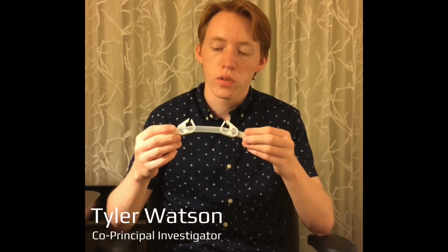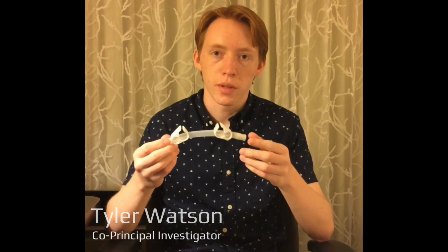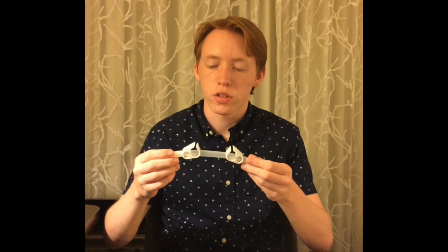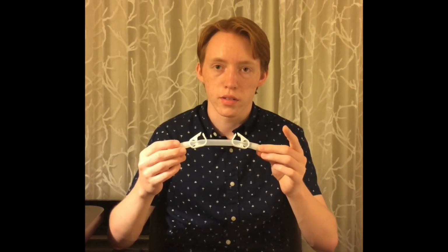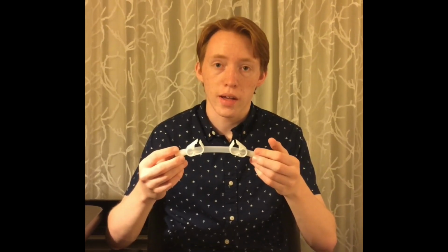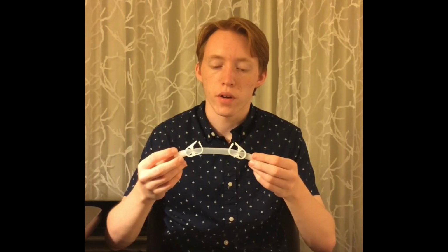Okay, here I have a fluid mixing enclosure, or an FME as we call it, for our experiment. Our main constraint was that it had to be conducted inside the small volume of this tube, and our experiment was the effect of ascorbic acid on the rate of regeneration in microgravity.